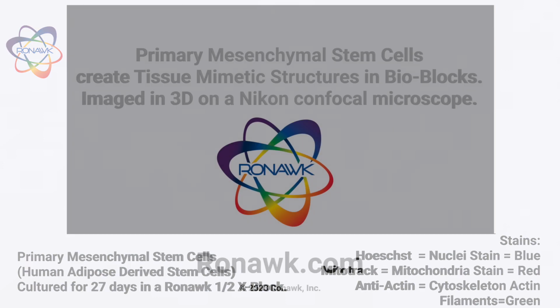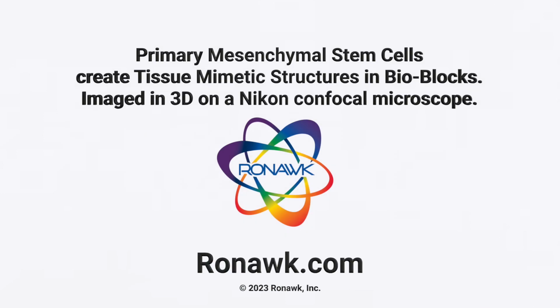Primary mesenchymal stem cells create tissue mimetic structures in bioblocks, imaged in 3D on a Nikon Confocal microscope.